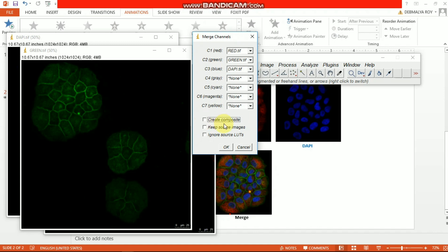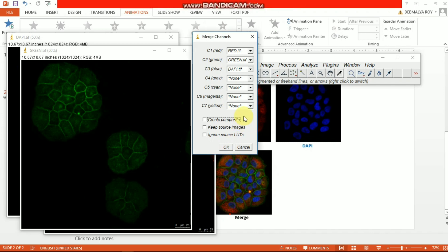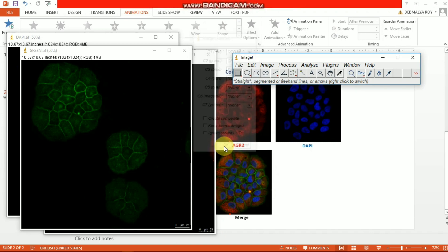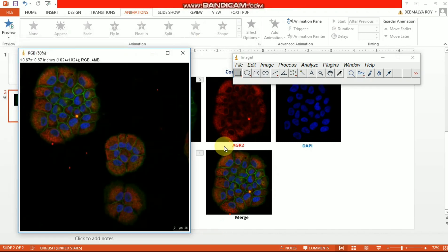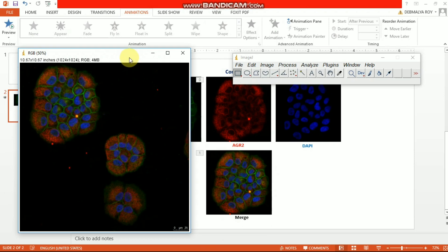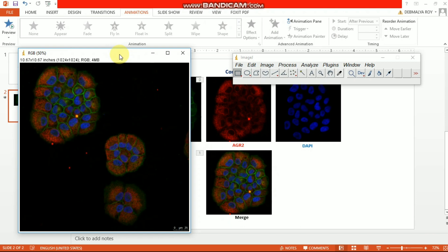When you merge your image, just hit this OK button and then you'll get your merged image. So you can see here this is the image using ImageJ I did just now.